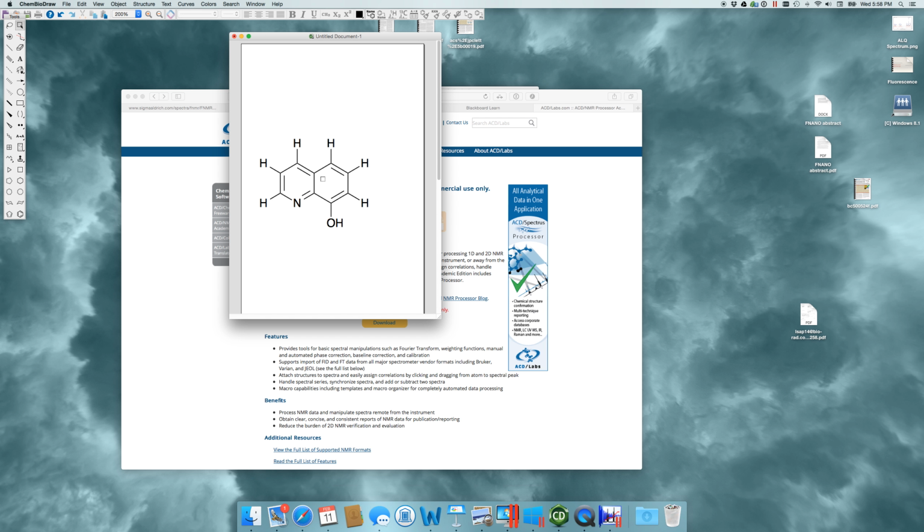Now we go up to our molecule. You've got 1, 2, 3, 4, 5, 6, 7. You'll notice no symmetry here, no symmetry there, no symmetry to the left, no symmetry to the right. All 7 protons are totally different. If you have no symmetry, that means each proton technically could have its own shift. It doesn't necessarily have to, but it could.